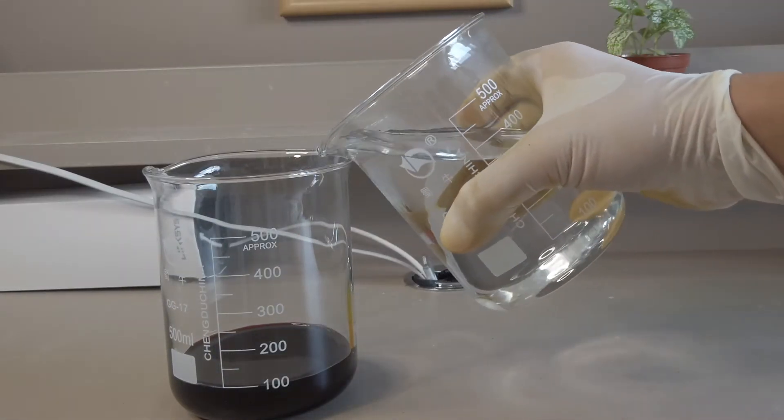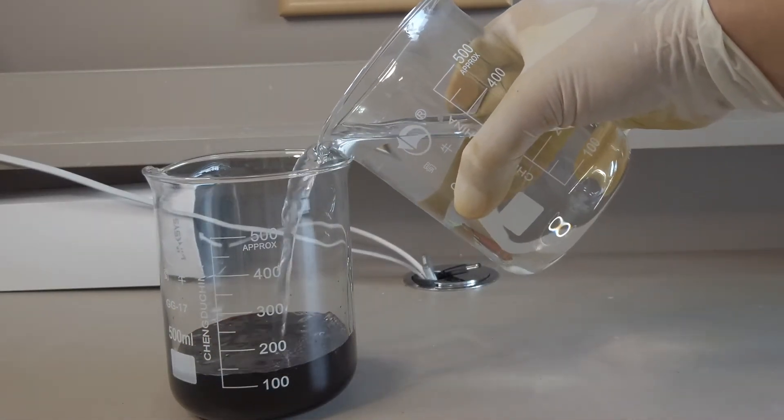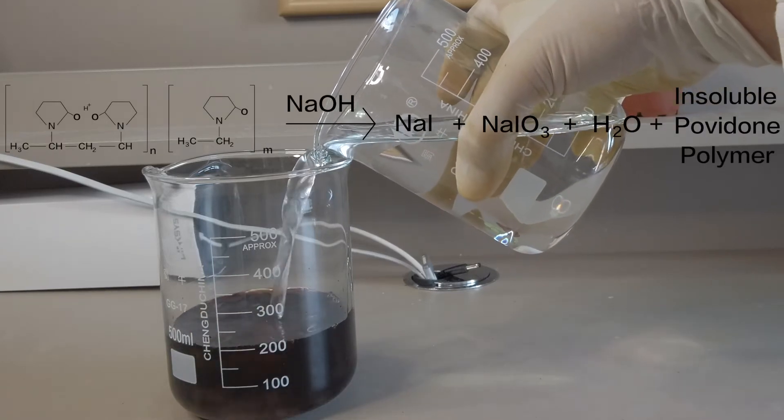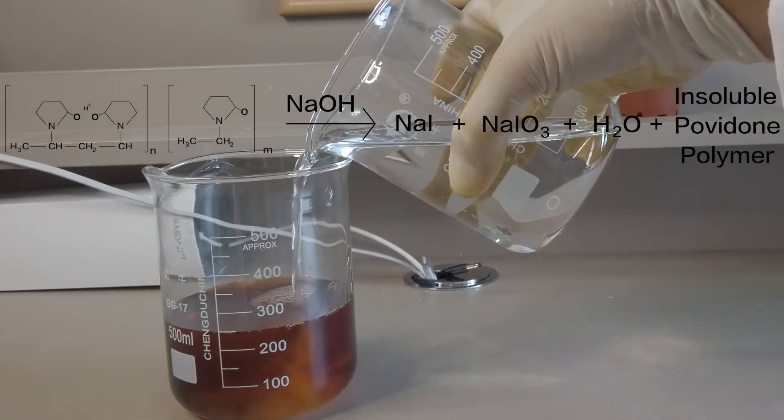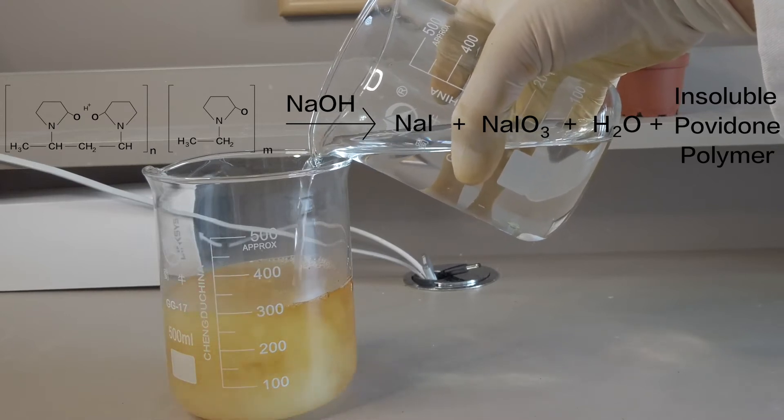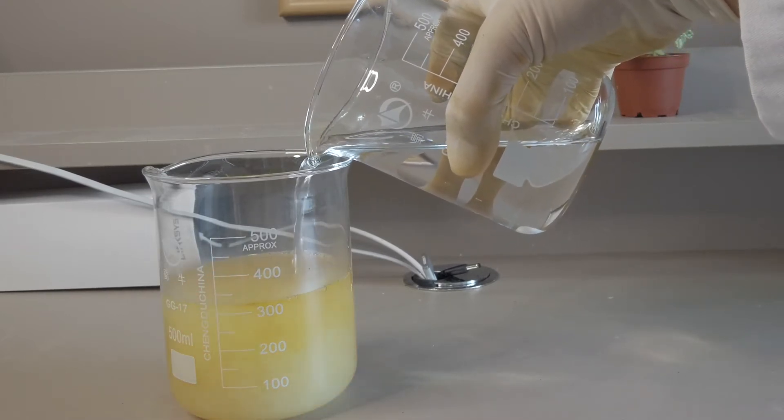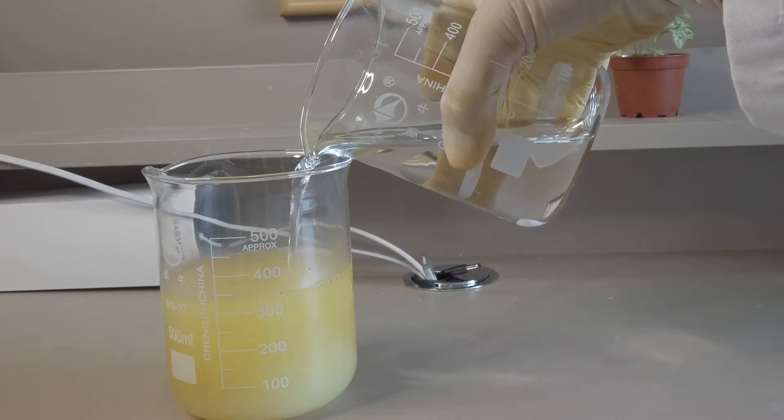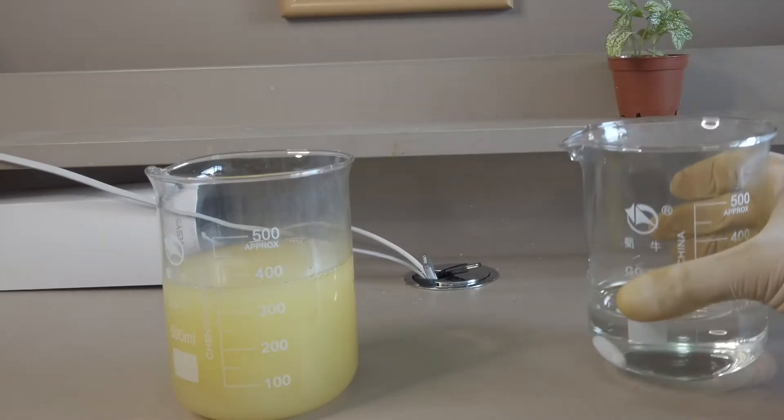Upon the addition of a strong base, the iodine is converted to its ion form while the water-soluble povidone is precipitated out as a water-insoluble polymer. As the concentration of the brown iodine decreases, the solution is slowly decolorized causing the solution to take on the yellow color of the insoluble polymer.